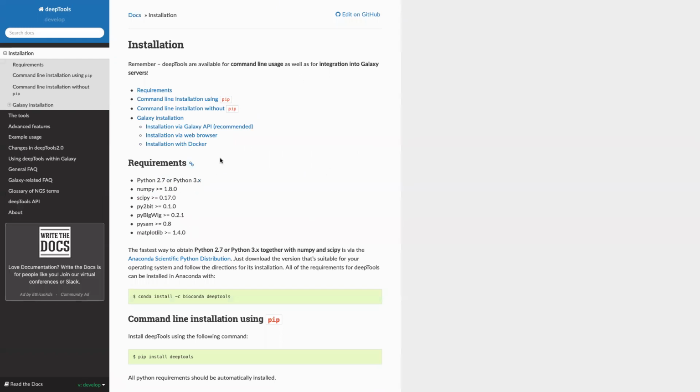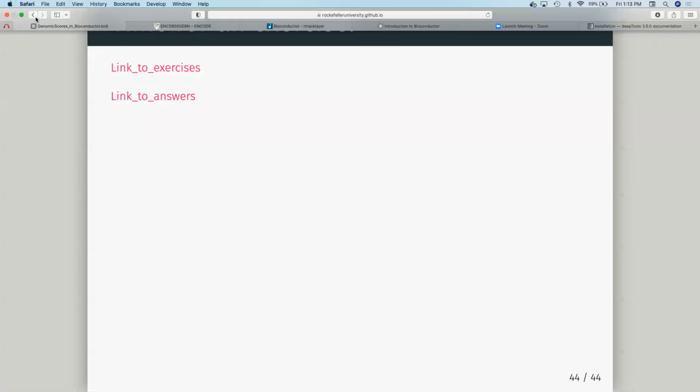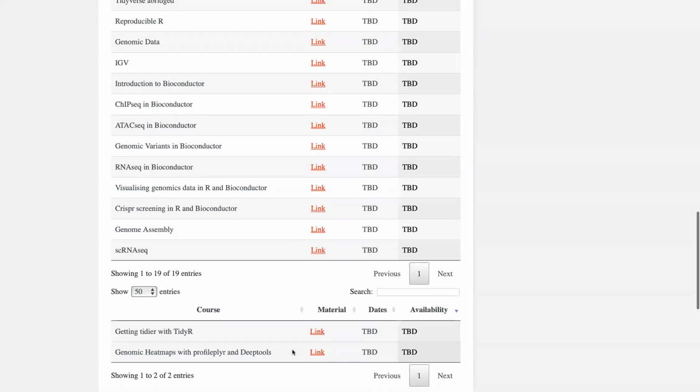But I do recommend, if you wanted to do bigwigs outside of R, you can do them in deepTools, and that will make your life easy if you don't want to get comfortable with R. So it's this one, I think, bigwig. He actually wrote R-lib-bigwig. That said, deepTools will show you how to use that from inside R later on in our session. So I think I'm going to cover that in some later sessions when we start to do visualization.